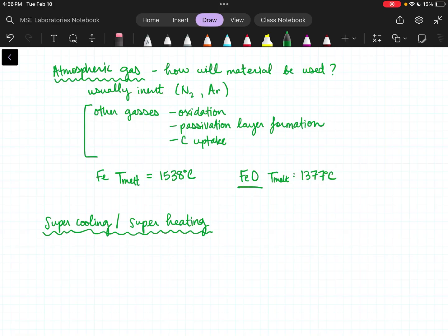Have you ever seen those videos, or even done it yourself, it's a fun experiment, where you put an unopened water bottle into the freezer and you don't shake it, you don't do anything with it, and it gets to freezer temperature, but it's still liquid. And then you smack it on the table and it freezes completely. That is supercooling. It's the ability for a liquid to get much colder than its freezing temperature because it needs a nucleation site before it starts to form crystals for crystallization.